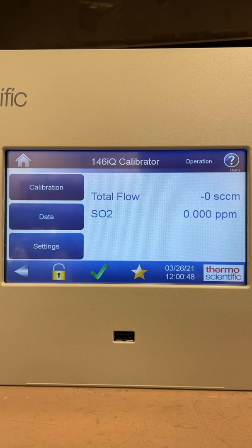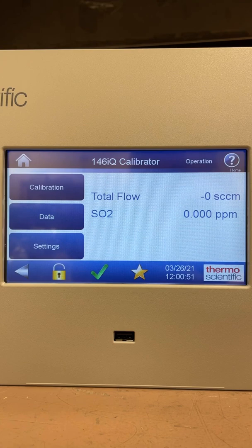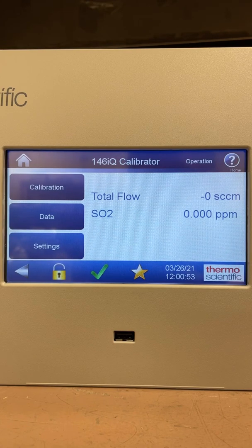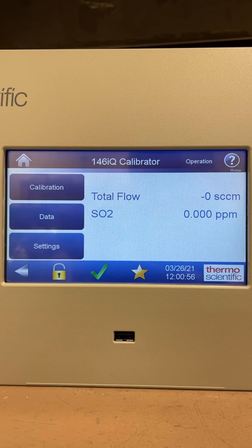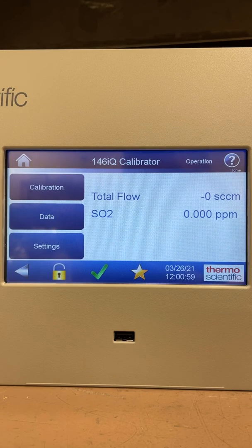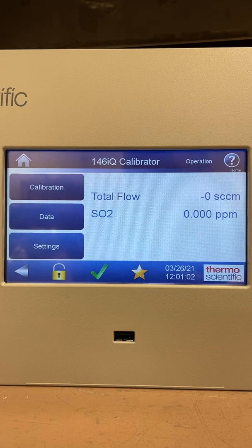Hi everyone, Jim with CDNova Instruments again. Today we're looking at the Thermo Scientific 146iQ Multigas Calibrator, and I'm going to go through a few of the menu settings on how to actually operate the calibrator.